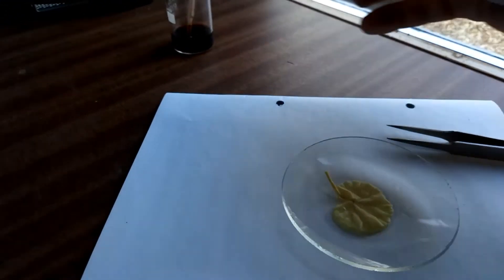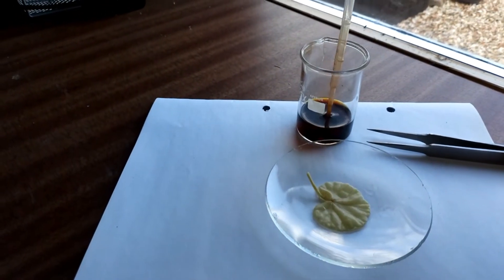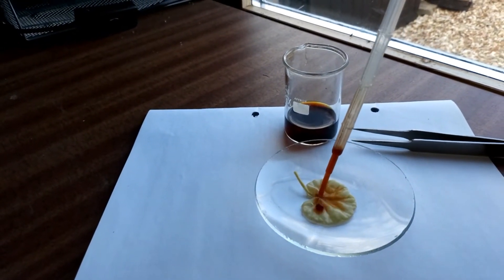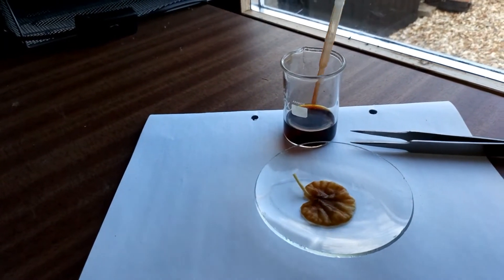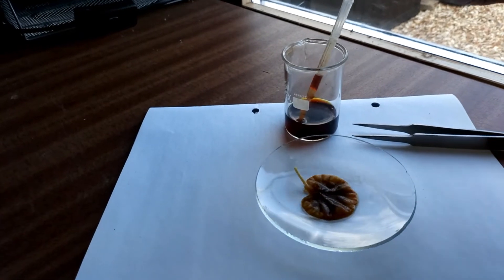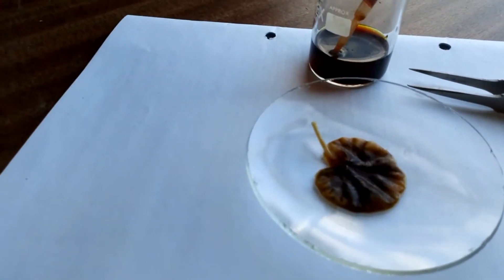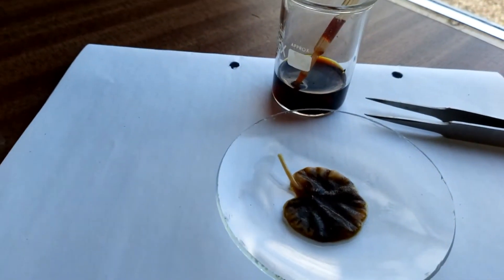So having done that we're now ready to put the iodine solution on. So just get a little bit, put the pipette there. Remember we're testing it now for starch. And if it goes a dark color, then we've got starch present. And you can see there that that has indeed gone a dark color.